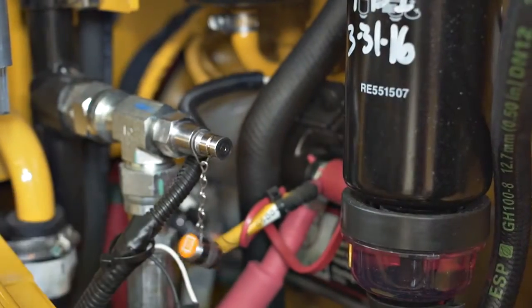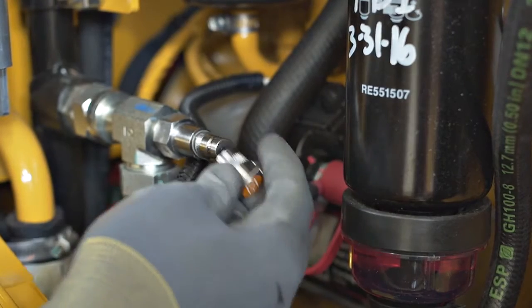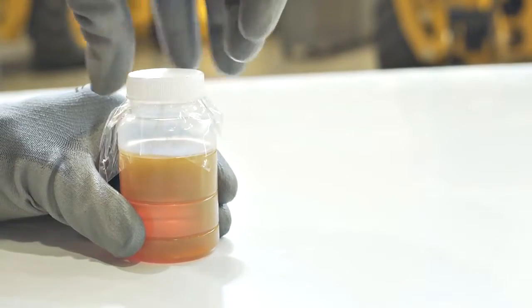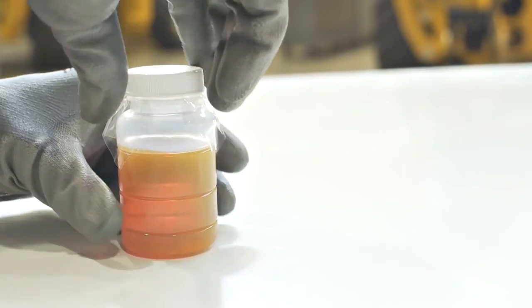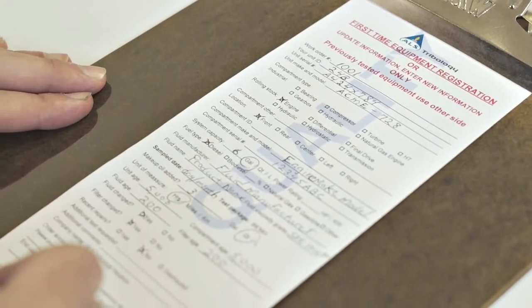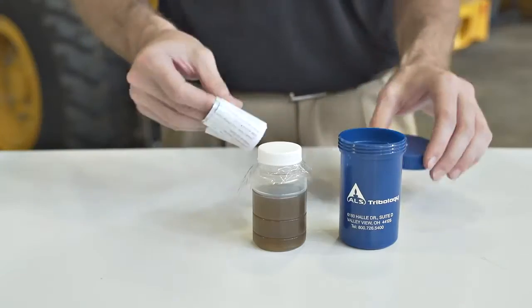Once a representative sample has been obtained, remove the probe tube from the sampling port and immediately seal the lid to the container. When properly performed, the oil sample will be warm, indicating that a representative sample has been obtained and all stagnant fluid was removed during the purge process.